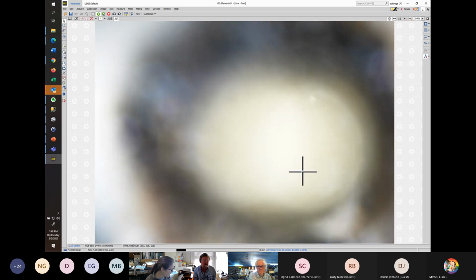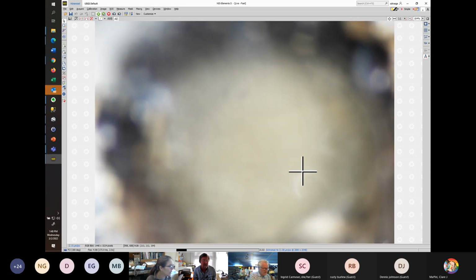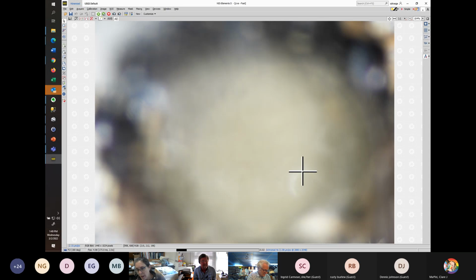You have this one down as being wheeleri? I had this as tinctus. Oh, tinctus. Okay. Actually, in my notes I had it as near tinctus. So in my notes, for tinctus, the punctures on the scutum are normal, meaning they're anywhere between 1/2 and 1 puncture width across.